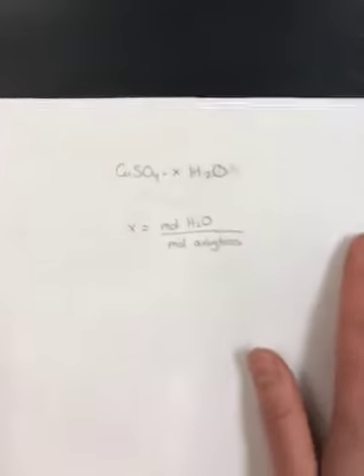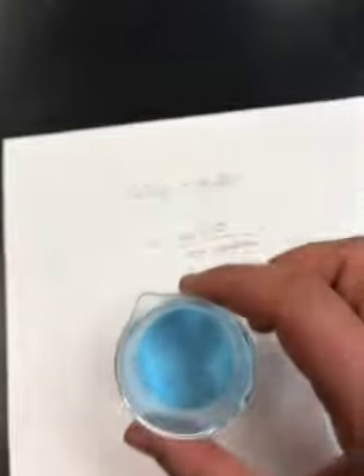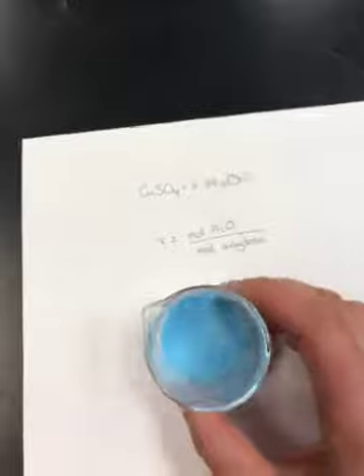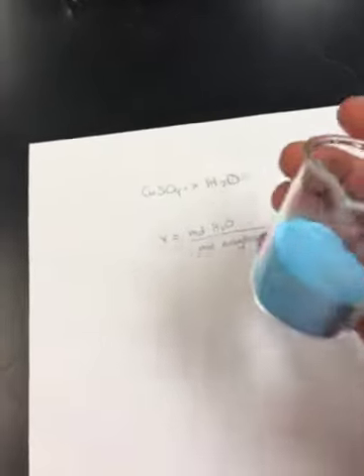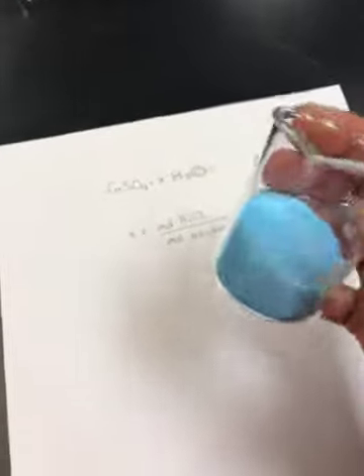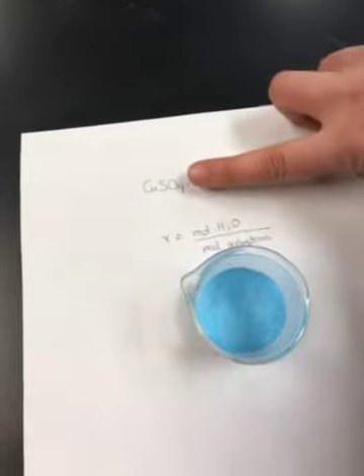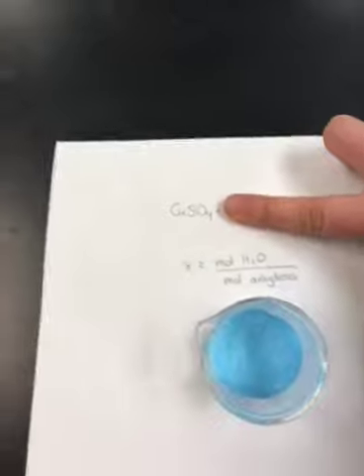Well, we take some of our hydrate, which is the copper 2 sulfate hydrate. This is what it looks like. It's a beautiful blue color. We're going to mass it. Then we're going to heat it up so that we drive off the water. Now remember, this is an ionic substance, so nothing will happen to the copper sulfate itself if you heat it. It's not going to melt, it's not going to vaporize, it's not going to do any chemical reaction. All that's going to happen if we heat it is we're going to drive off the water. So after heating it, what we're going to be left with is the anhydrous, the dry CuSO4.